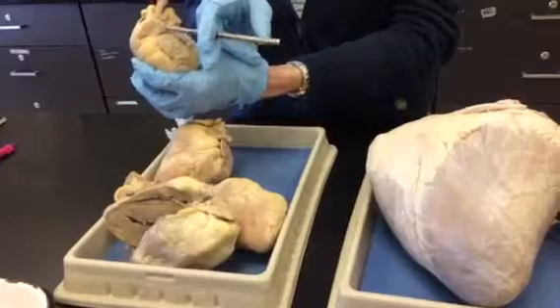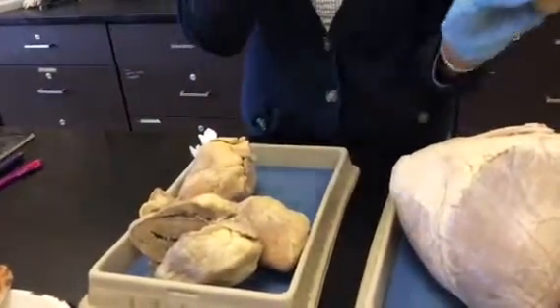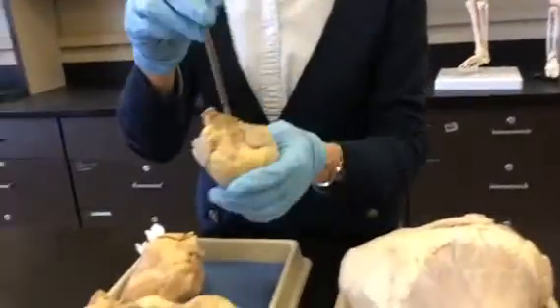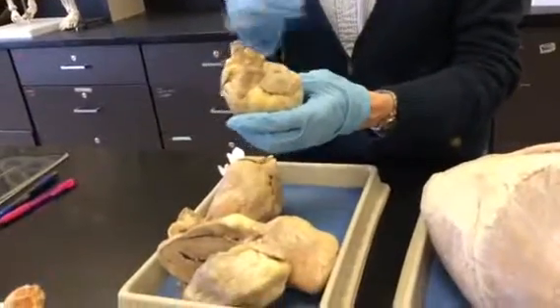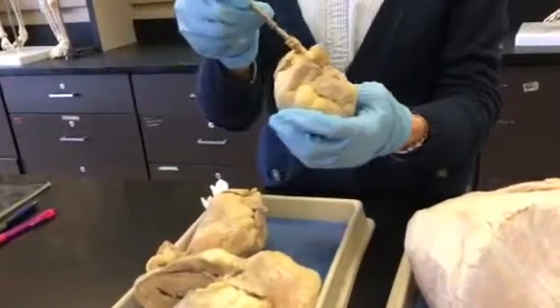Here's the pulmonary artery, straight up and down, great big vessel on the top there. That's the aorta. This branch right here coming off the aorta — that's the first branch off the aorta. That's the brachiocephalic artery.